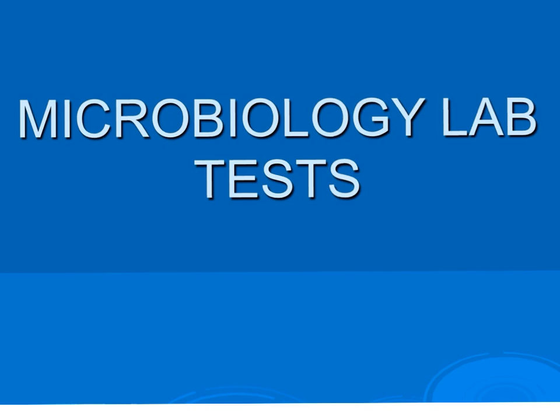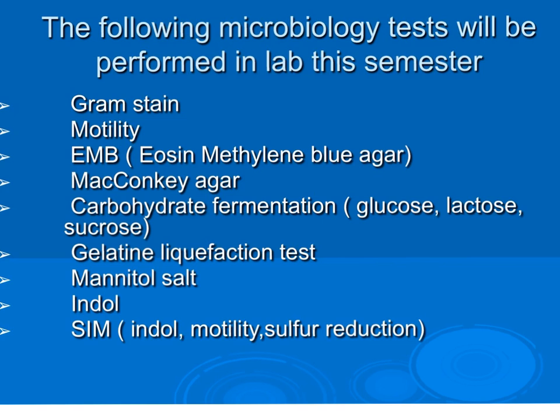Now, do keep in mind that some microbiology lab tests are better than others, and I do have 2 videos on the microbiology lab tests. You can see them on YouTube at Kim Owen or on my website, kowenscience.com, and you can see which tests work best. But these are the tests that I typically run, and you'll notice that gram stain is number 1 because that's the most important one. That's what I would always start with for identifying the unknown.